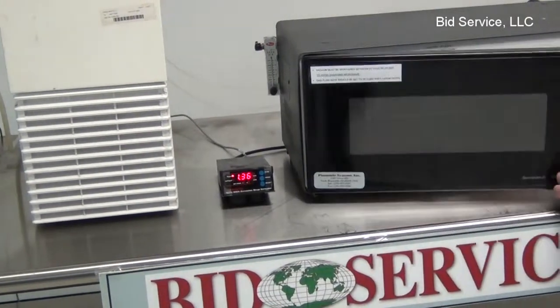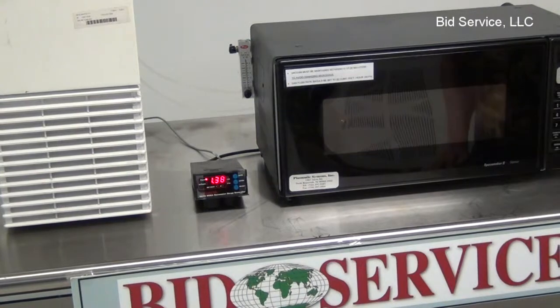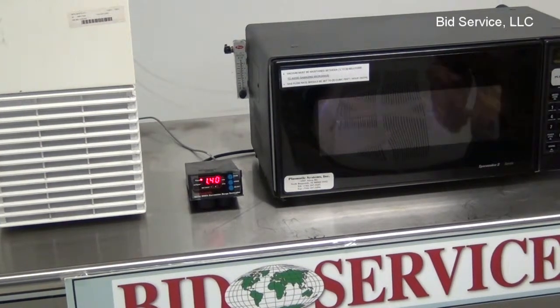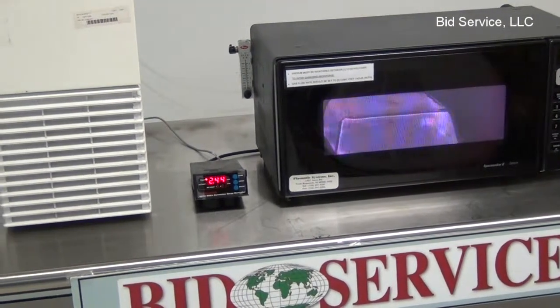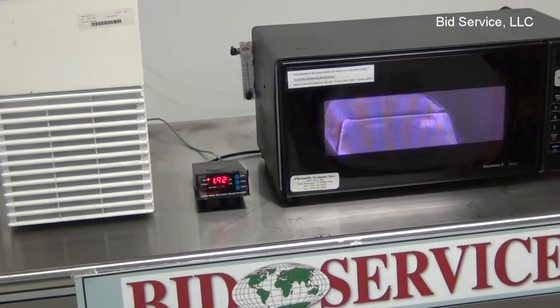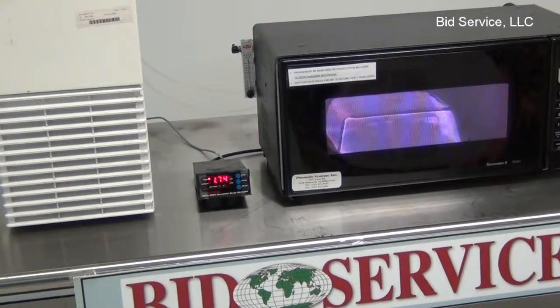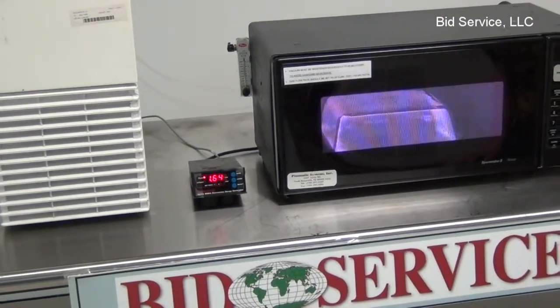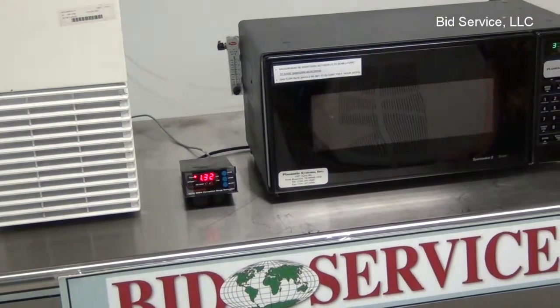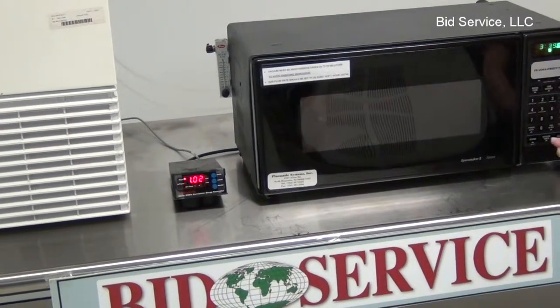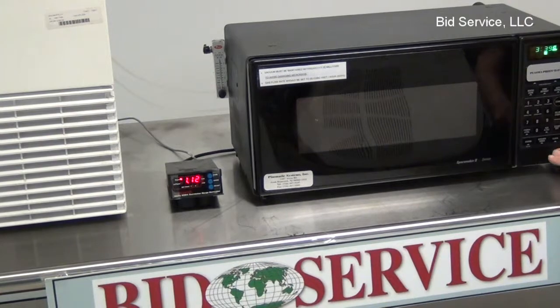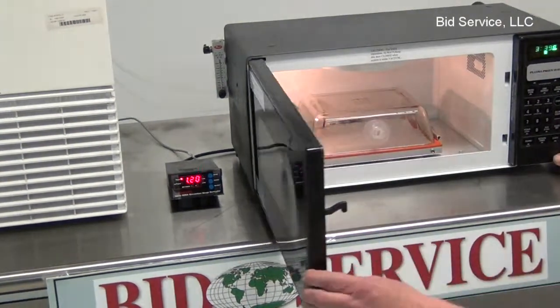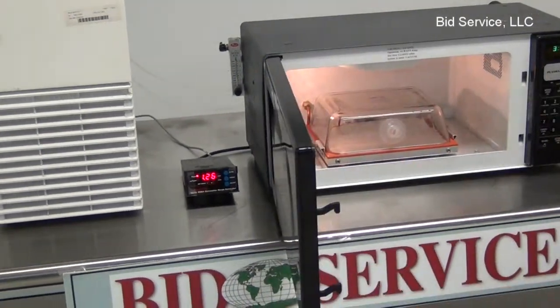Just to prove how efficiently that works, if I press the unlock button, even before it gets halfway or even starts to detach the door, as you can see, it has already turned off the microwave. So it's very, very safe.